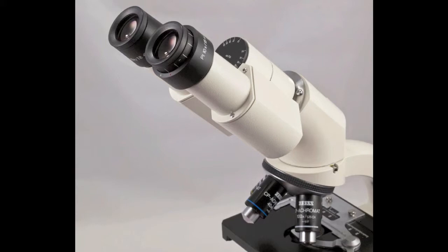Now let's look at the lens assembly on the microscope. This includes the objective lenses, the tube containing lenses and mirrors to redirect the light, and the ocular lenses in the two eyepieces.